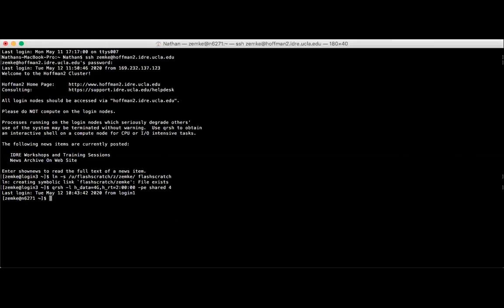Okay, so my interactive session was granted. So what we're gonna do next is enter the directory we're gonna work in, which is the flash scratch, cd flash scratch, and then we're gonna download the SRA toolkit, and this is a long link, so I'm gonna copy. Oops, I just realized they're hyperlinked, so be careful if you click on them.